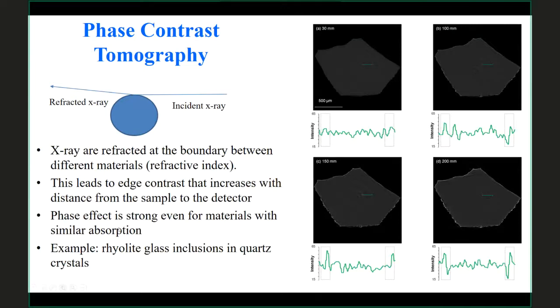And the nice thing is this phase refraction effect is strong even for materials with very similar absorptions. So if you have two materials next to each other that you can't tell apart with absorption, you can often see it with phase contrast.